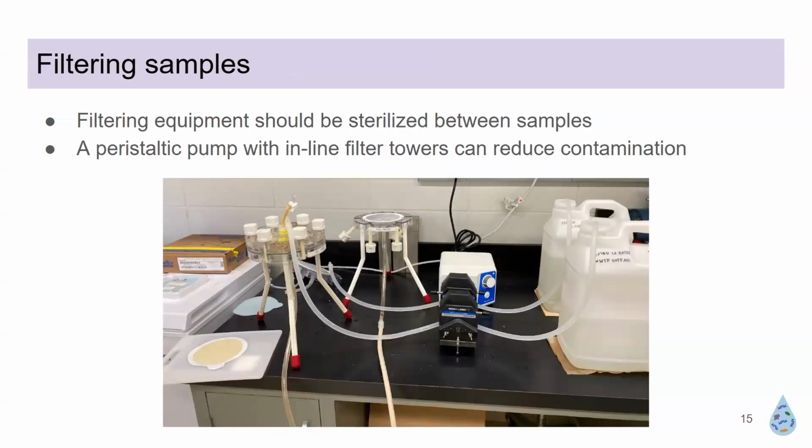Back in the lab, you're gonna do a lot of filtering of water. So filtering equipment should be sterilized between samples. Again, sterility during every part of the process. And this is detailed in those protocols that are on the website. And this picture right here is what's set up on the filtering station in the back.